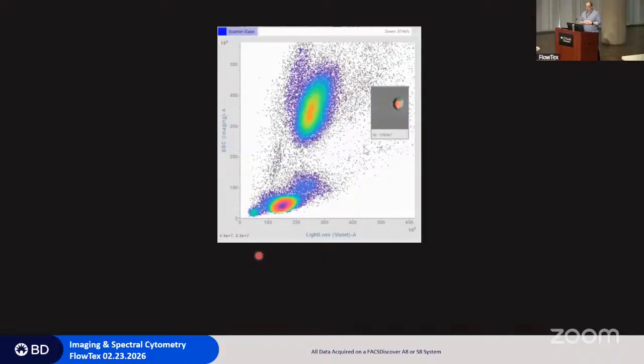So in actuality, it gives you the ability to look at your sample in 5 dimensions, because you've got the dot plot in 2, and then up to 3 or even more colors on the plot. But let's talk a little bit about what those images are.